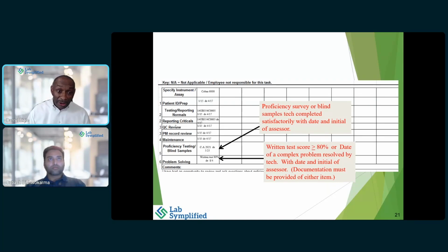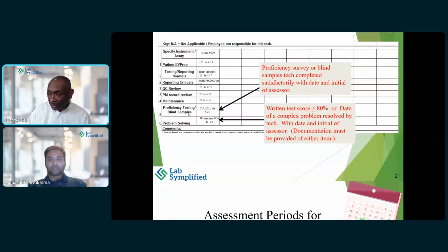But I'm gonna tell you from being experienced, I've been inspected by CMS, and they've been there for 3 weeks. FDA, if they come in for 3 weeks, they'll sit there and go through every piece of paper it asks you to document. You need to have that backed up and ready to produce. If you're gonna do just these, use a spreadsheet and just have these notations like this.